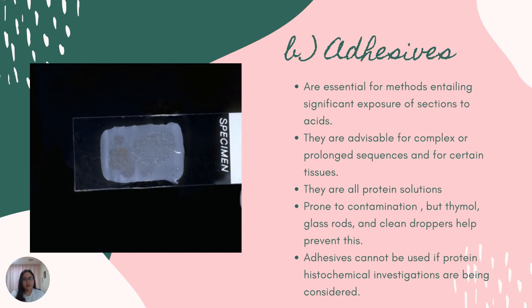They are also all protein solutions, but they are very prone to contamination, but thymol, glass rods, and clean droppers help prevent this. And the last one is that adhesives cannot be used if protein histochemical investigations are being considered.